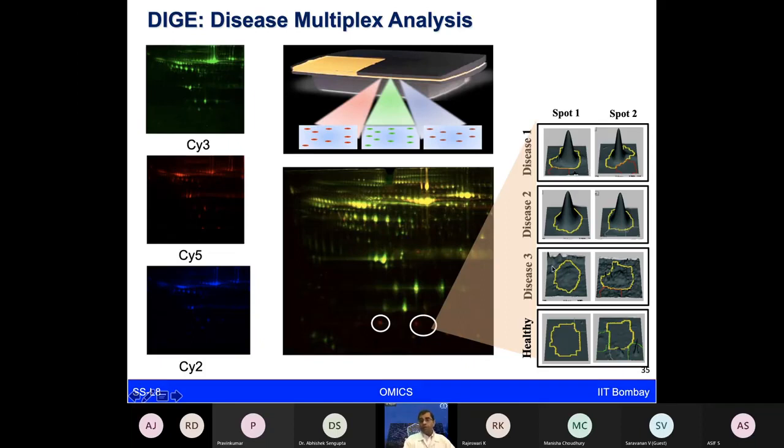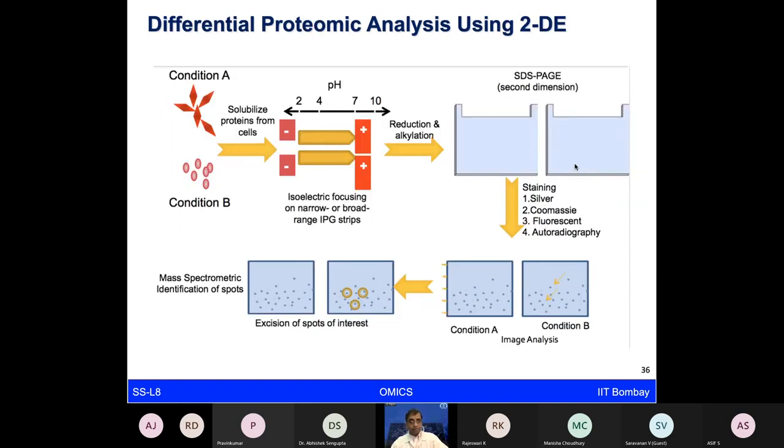And also the same protein, when we looked at it in dengue fever, it was not showing much response. It showed really huge response in the 2 malarial fevers like falciparum and vivax. So based on these experiments, this is kind of an interesting observation you can make. And then you want to go and find out what this protein is, which is showing me this kind of sharp 3-dimensional peak. And then you can use mass spectrometry technology to identify the proteins of interest.